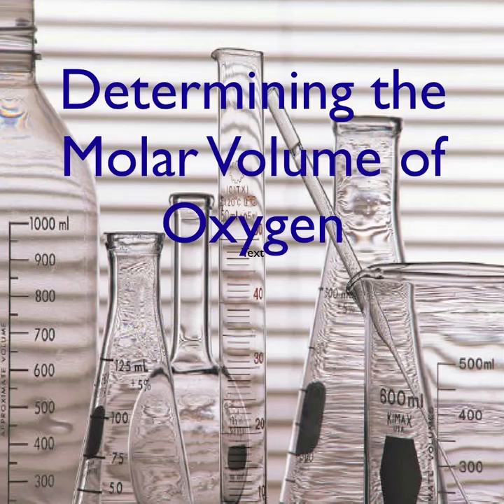In this week's experiment, we will be determining the gas constant R and the molar volume of oxygen. The molar volume is the volume occupied by 1 mole of a substance, whether it be a chemical element or a chemical compound, at a given temperature and pressure. 1 mole of any ideal gas occupies 22.4 liters at standard temperature and pressure.